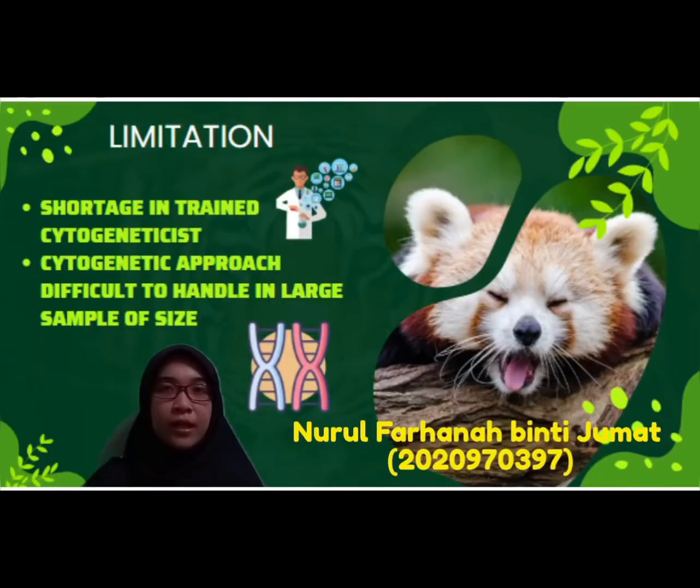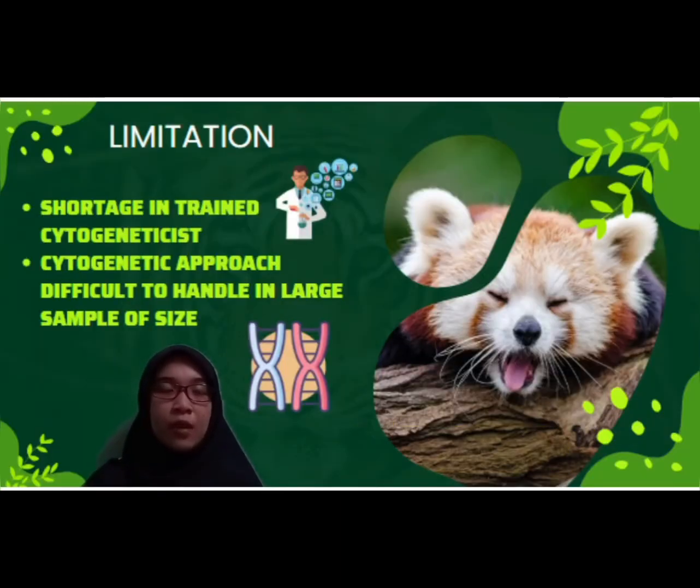Hi, my name is Farhanah. I will proceed to the limitations of cytogenetics. One of the limitations of this technique is the shortage of trained cytogeneticists, as some of these methods need to be combined with other, more technologically advanced methods that need good expertise in handling the technique. Besides that, this method is difficult to handle with large sample sizes. This is due to some methods in this technique not being suitable for large sample sizes. Thus, it will cause the usage of long-term tissue culture that is more expensive and difficult to maintain.